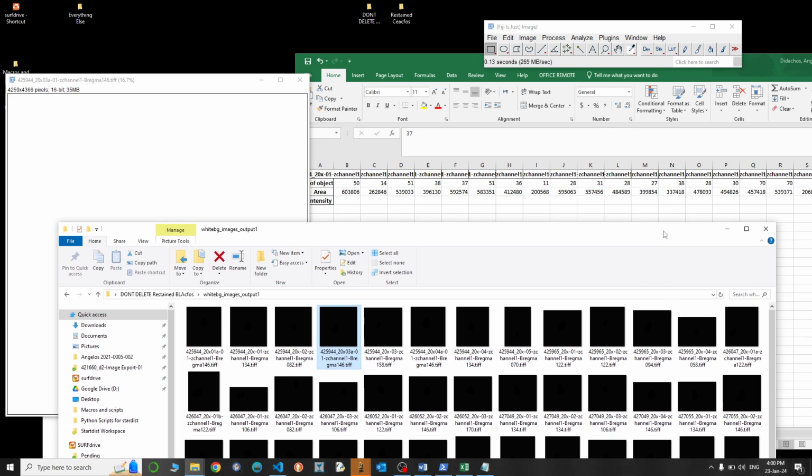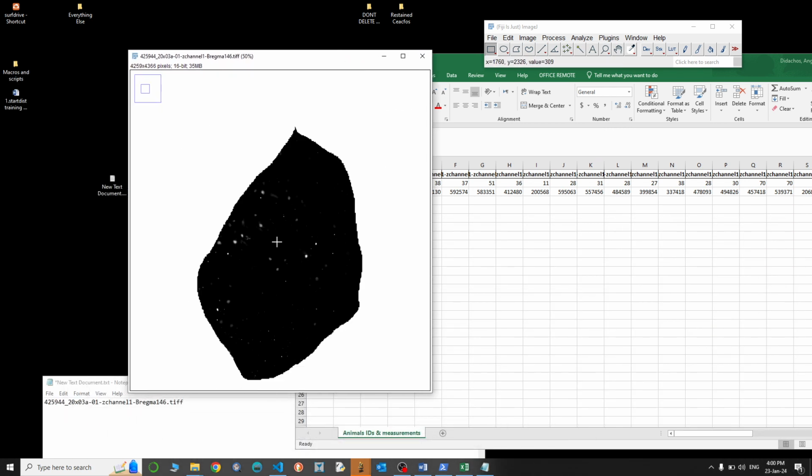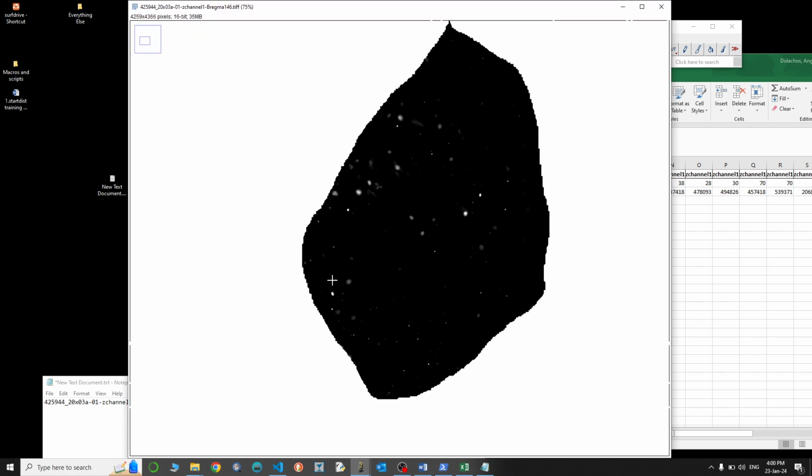All right. So now what I'm gonna do is, well, you can do freehand or you can do polygon selection. I think the freehand will be a bit easier. I'm working from a laptop today, so it's not very convenient, I have to say, but I'll try to do my best.